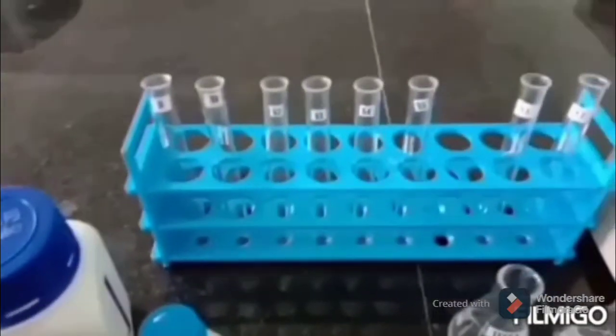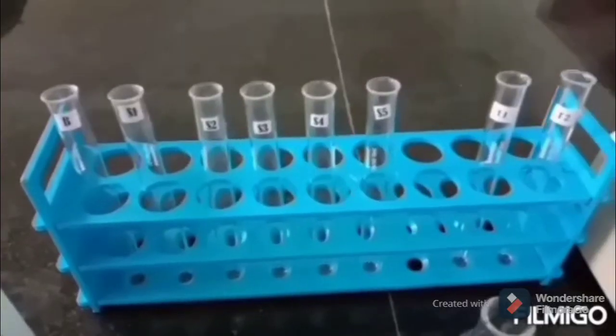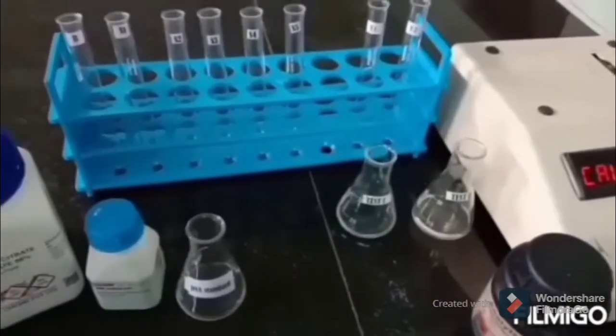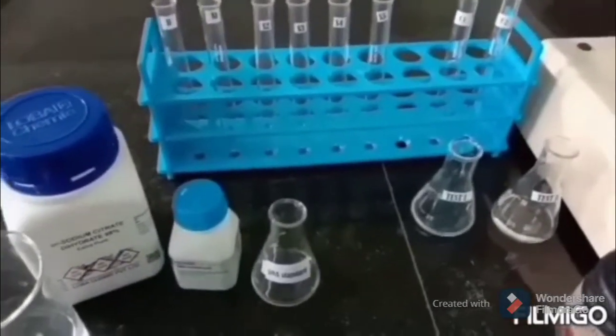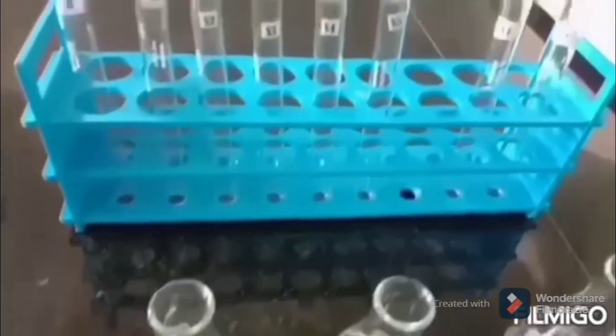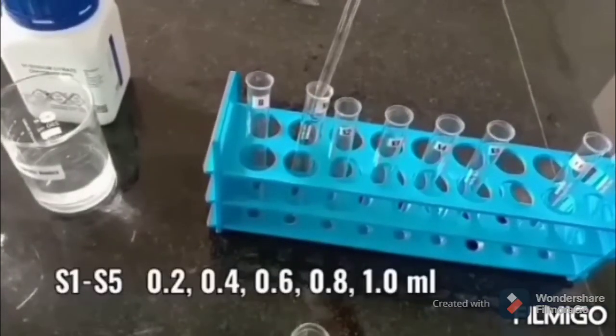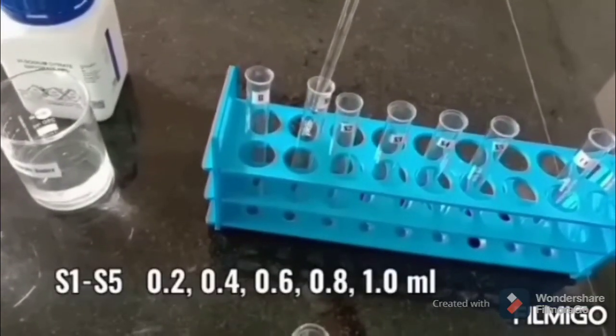Further we need test tubes marked B for blank, standard tubes S1 to S5 for standards, T1 T2 for tests, pipettes, boiling water bath, and colorimeter. The procedure starts with the addition of working standard of 0.25 milligram per ml concentration to standard test tubes marked S1 to S5.